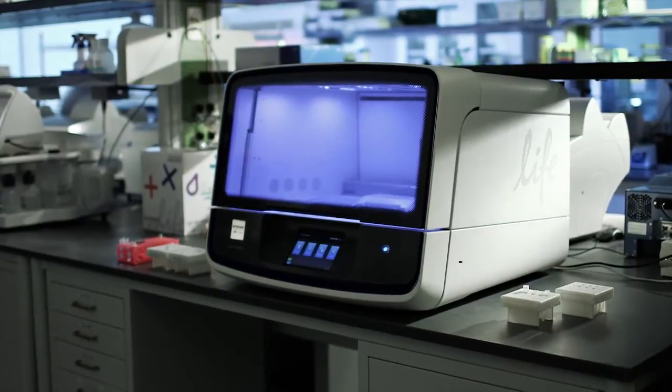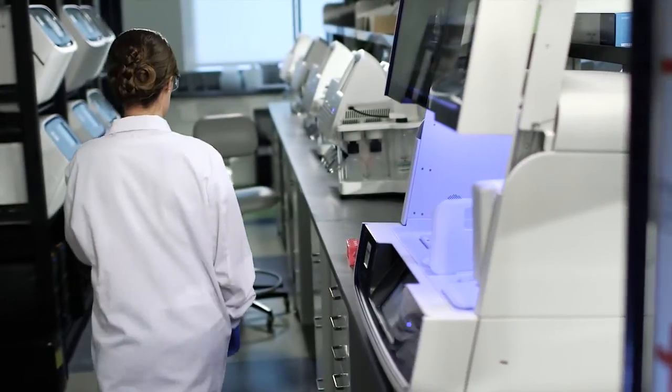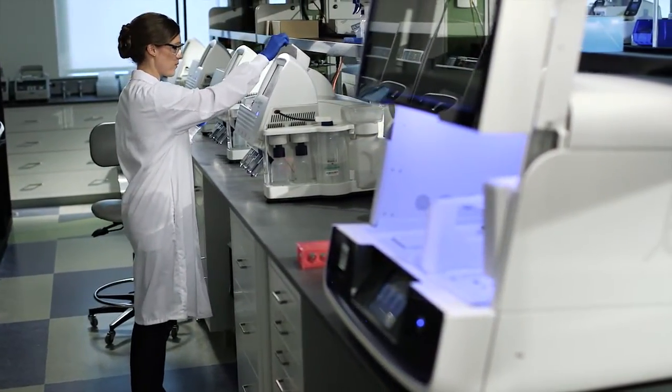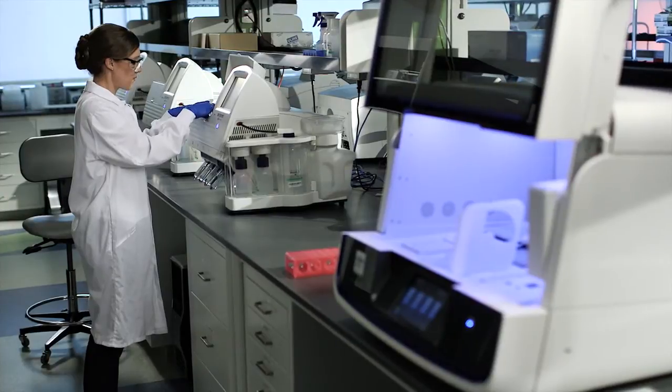The Ion Chef system simplifies the workflow for the Ion PGM and Ion Proton systems, minimizes sources of variability, and helps to save time and labor. Together with Ion AmpliSeq gene panels and the Ion PGM system, it delivers the industry's simplest and fastest gene panel workflow.